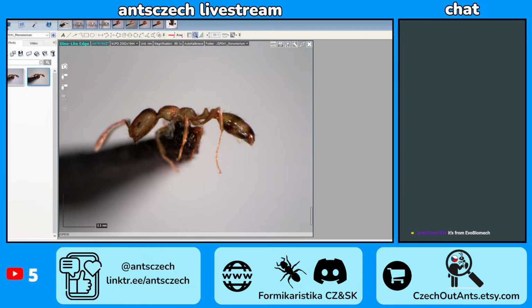But I think it mostly resembles glue. Also, if you look at the point, I think it's covered in the same shade of white. It's just weird because it looks more like a featherish glue. Because normally the glue is never like that.